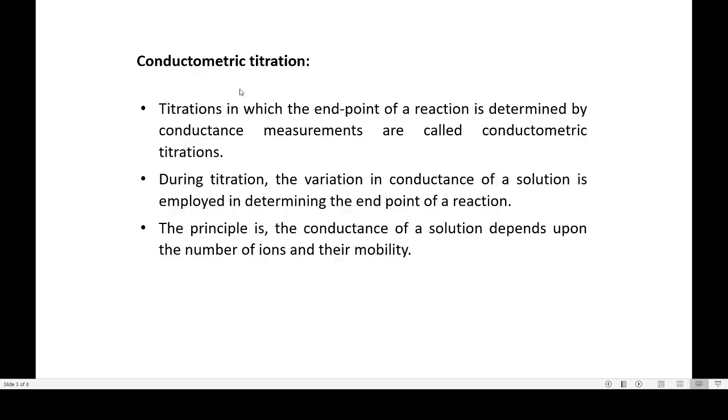But in conductometric titration, the end point of the reaction is determined by conductance measurements. By measuring the conductance of the solution and observing the changes in conductance upon addition of the titrant, the end point of the reaction is determined.